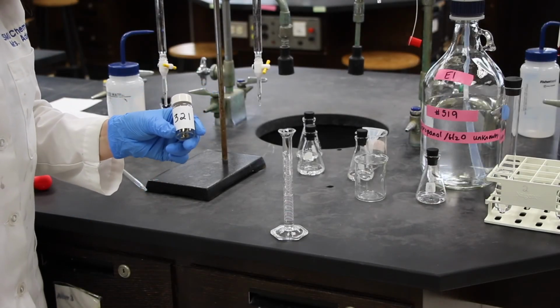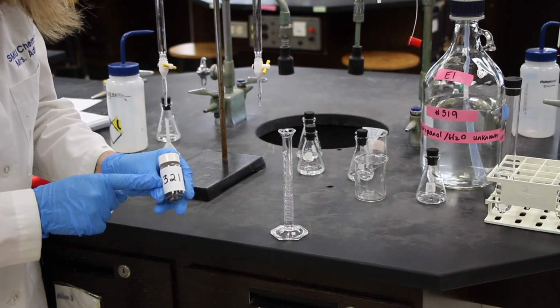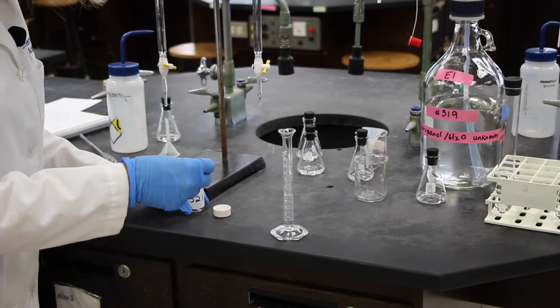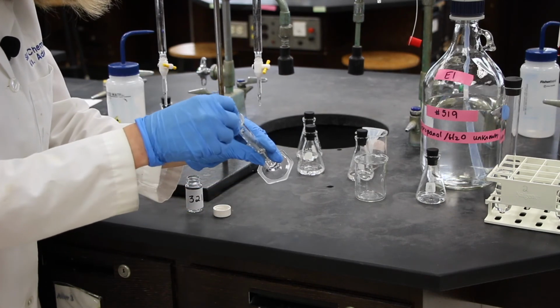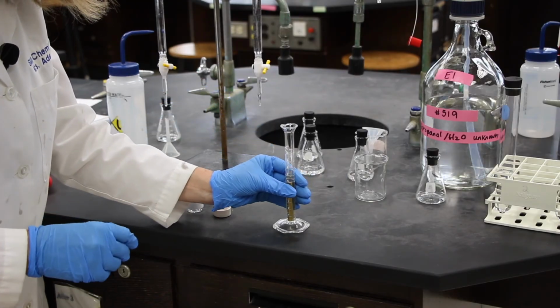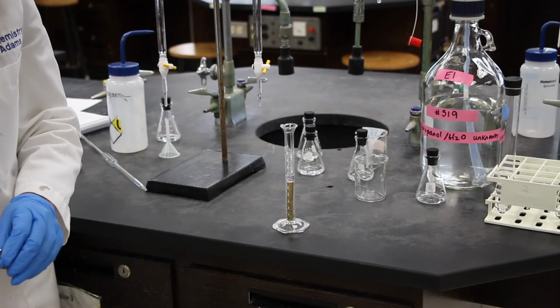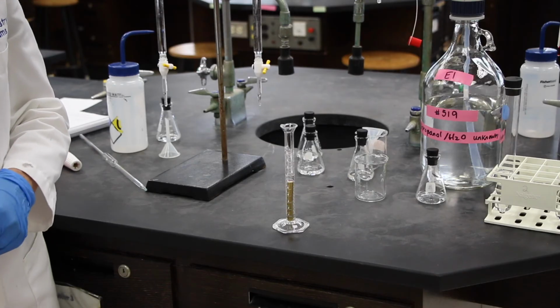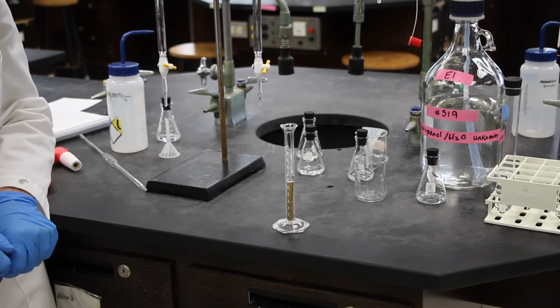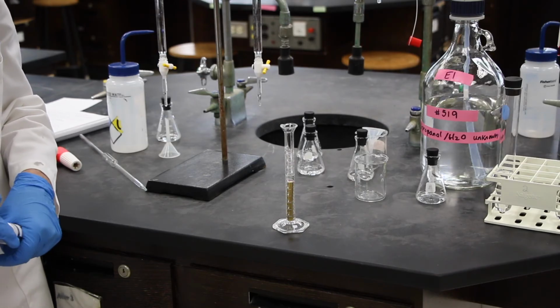Now we're going to add all our solid, and please make note of the unknown number, to the graduated cylinder. And we can now read the final volume. From this, you can calculate the density of the solid and determine what the identity of the solid is. Compare your density to the table in the lab manual to determine this.